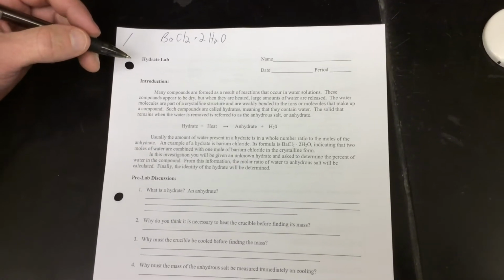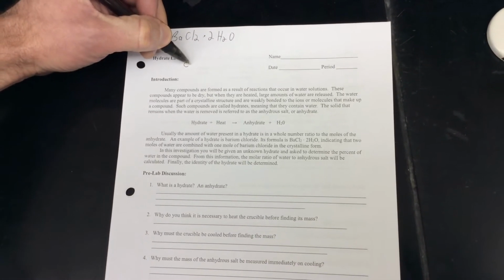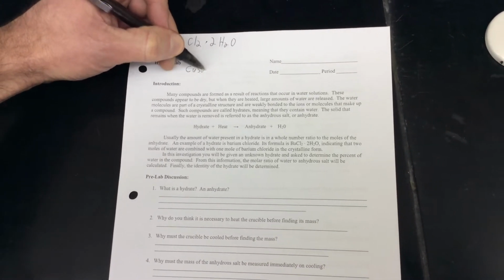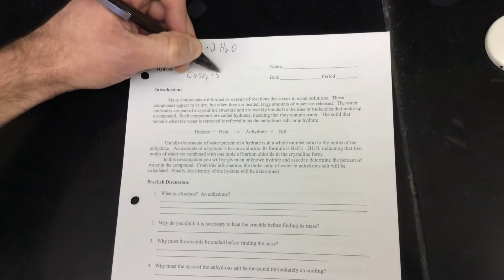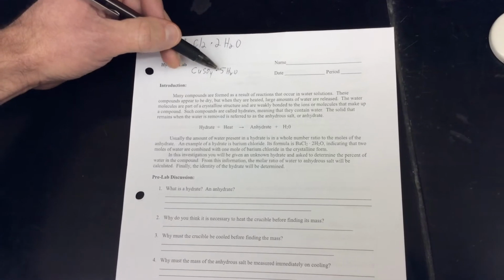We've done other experiments with hydrates. For example, one we've used a couple times by now is copper 2 sulfate, right? So that's copper 2 sulfate pentahydrate, right? So penta goes with the 5 for the water molecules.